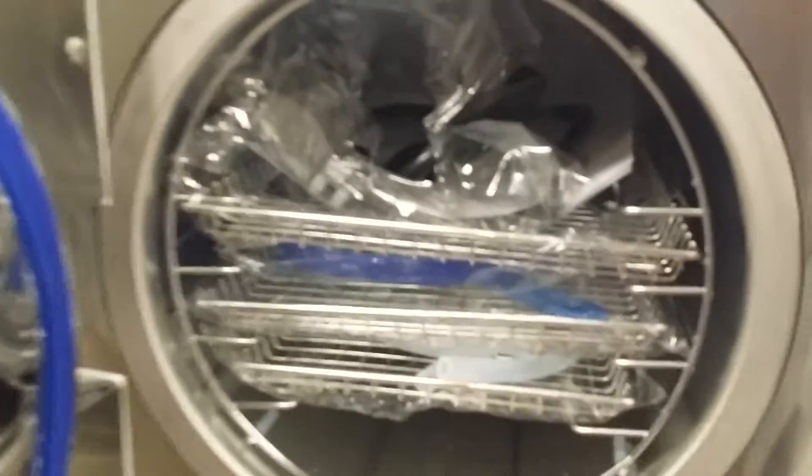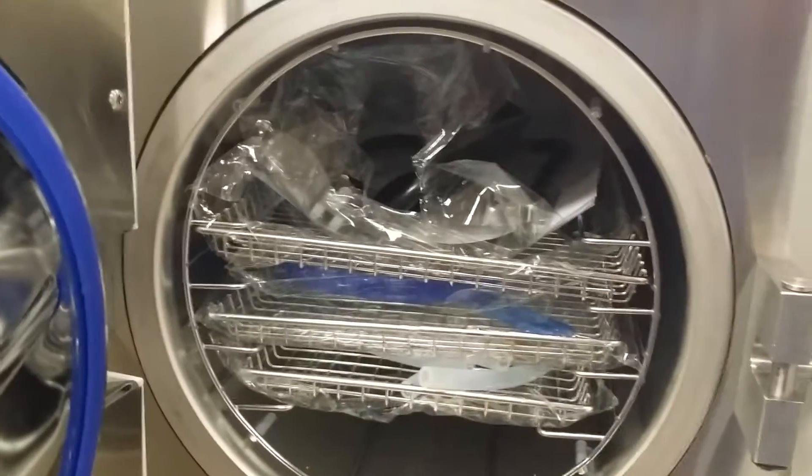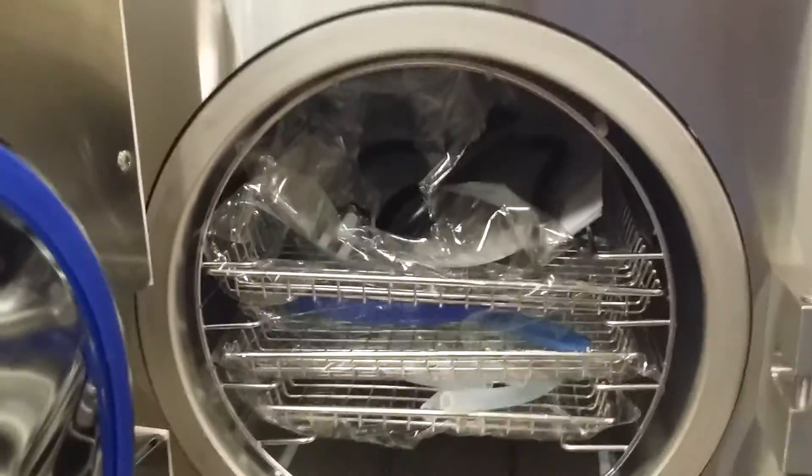The machine is very easy to use. On the bottom near the door, you just pull out the door handle and the door will open. The front size is about 10 inches in diameter and the depth is about 16 inches.